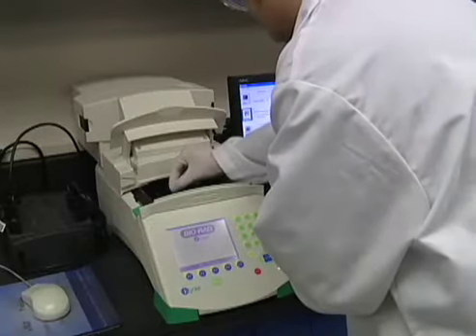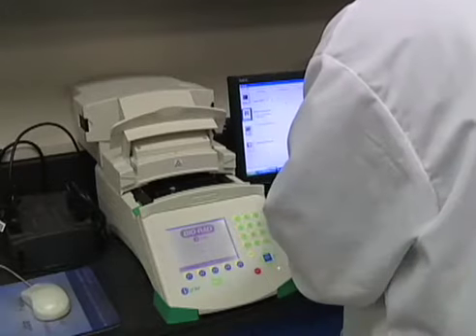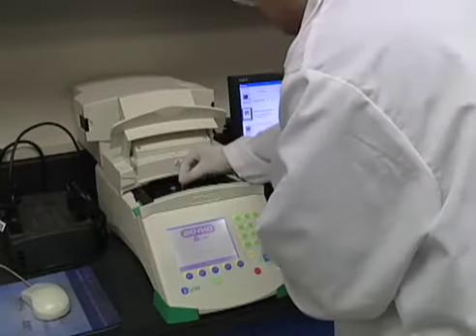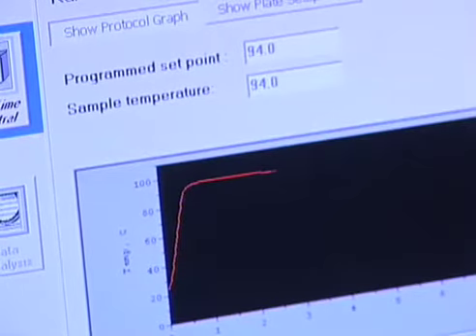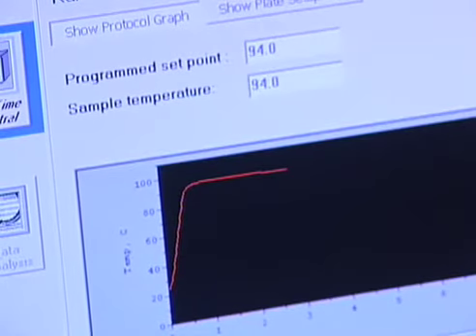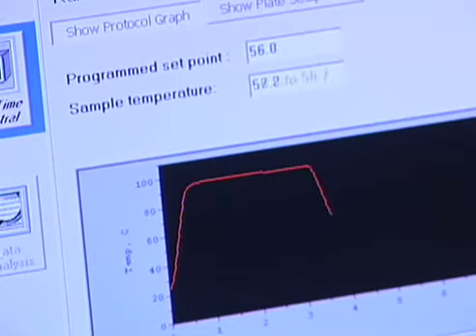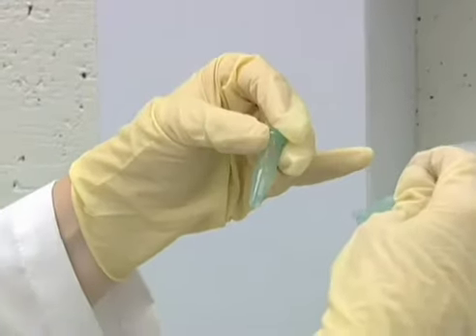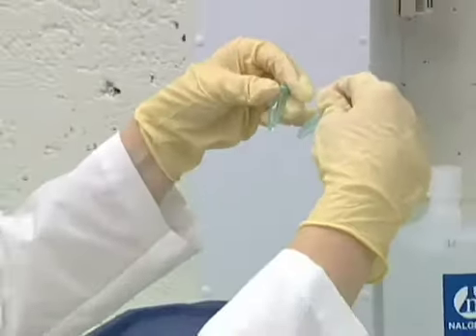Each slice is subjected individually to in-gel digestion, placing the tubes in a hot block overnight and using an enzyme that cuts proteins at specific amino acids. The proteins are then extracted from the gel.